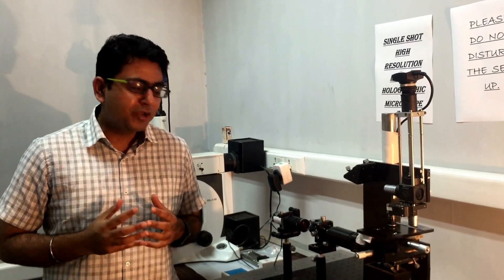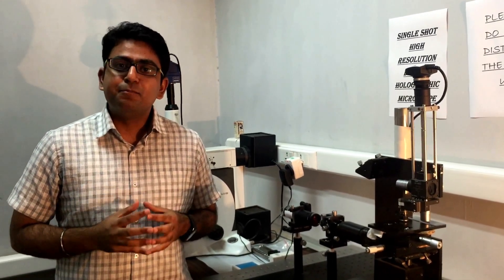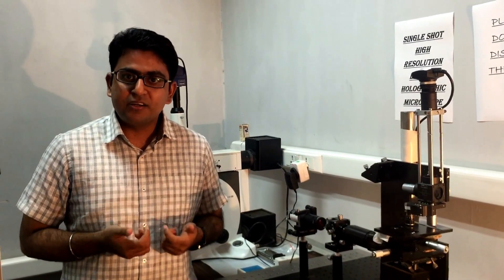Hello, today we are going to tell you about our simple, quick and economic method for blood quality assessment.